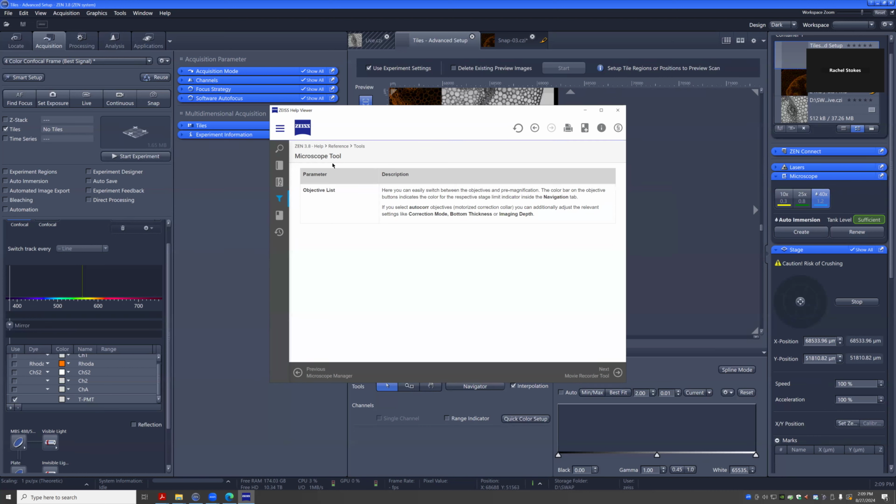But it's hard to predict how much, because this depends on room evaporation, right? We talked about that a little bit. That's why I was just curious how much that would be when you would need more. So that'll be a little bit more testing.